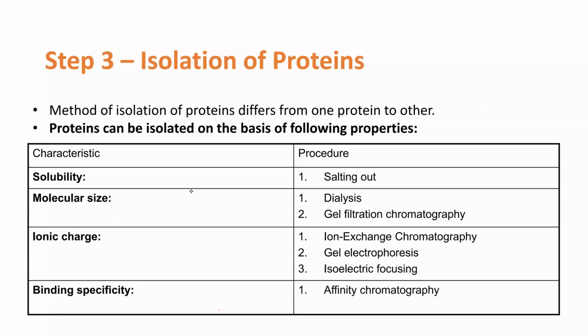So this is actually the isolation of proteins. That is the step. The method of isolation of proteins differs from one protein to another. It might not necessarily be that you are going to apply the same techniques in isolating different proteins, because the structure of the proteins varies. So you look at the protein itself, you check the literature for how it is structured, the nature of the protein as well. Then from there you apply the suitable isolation techniques to isolate the protein.